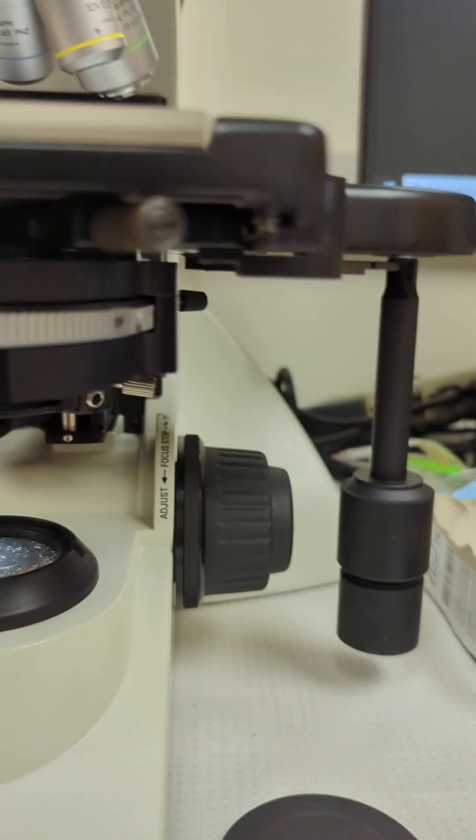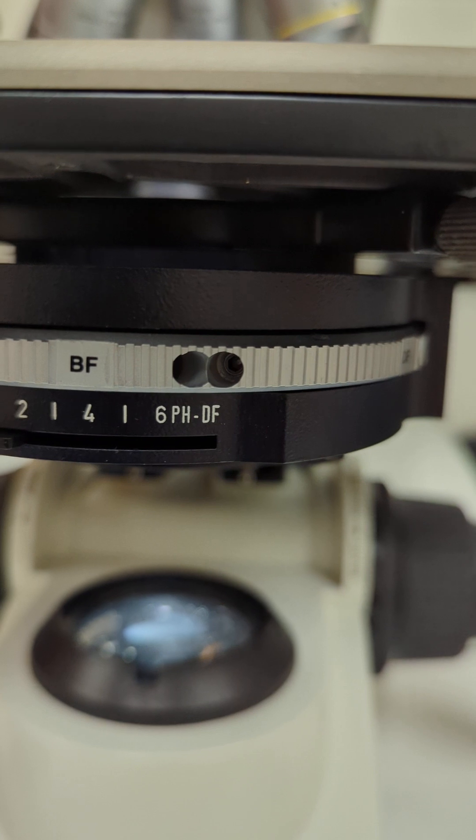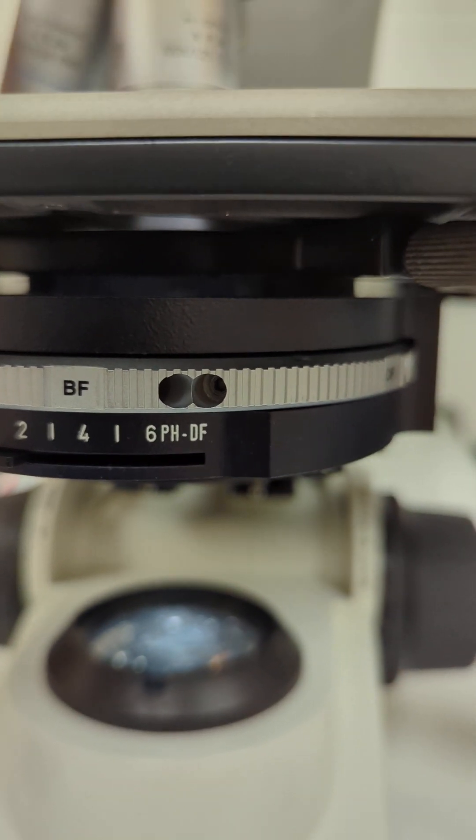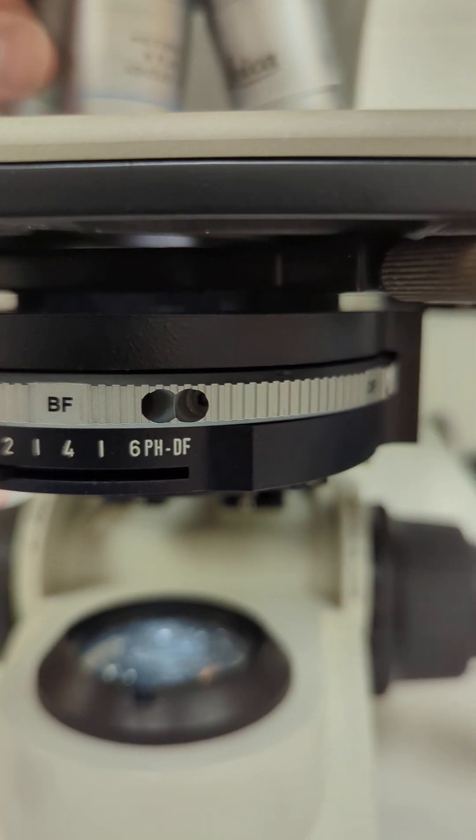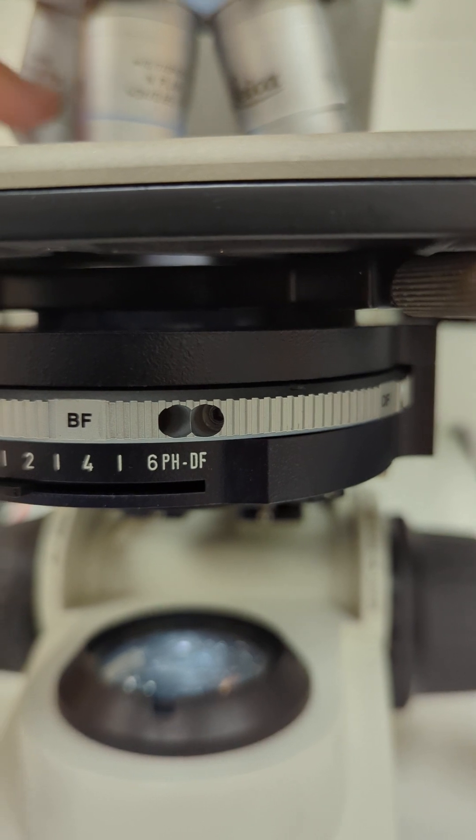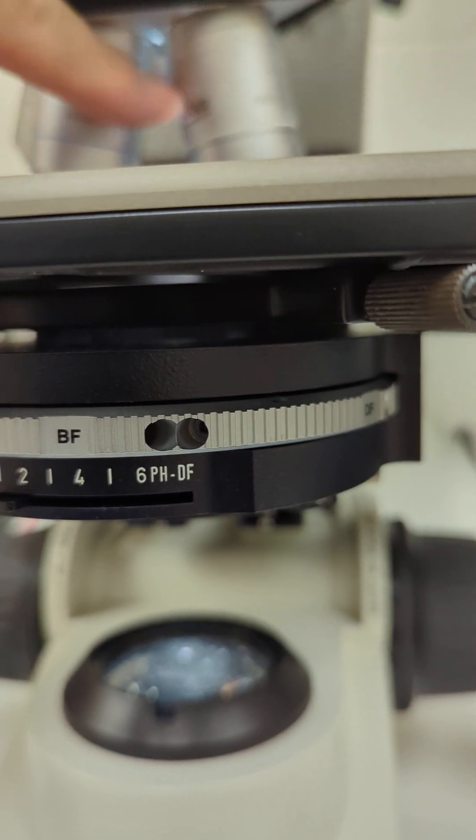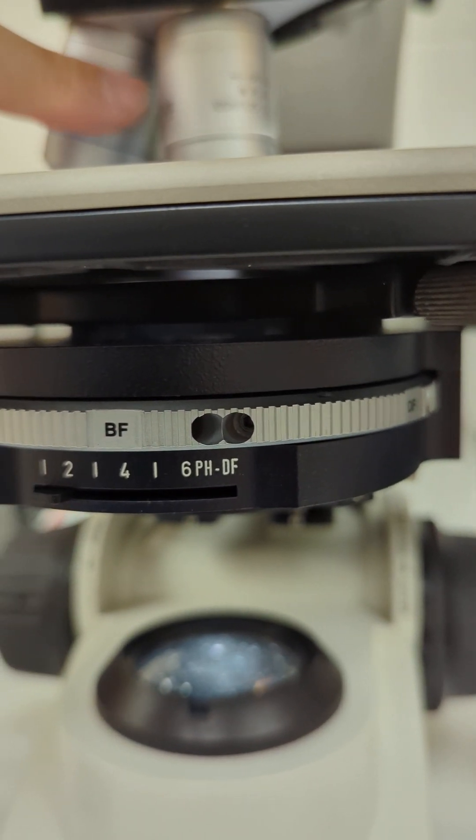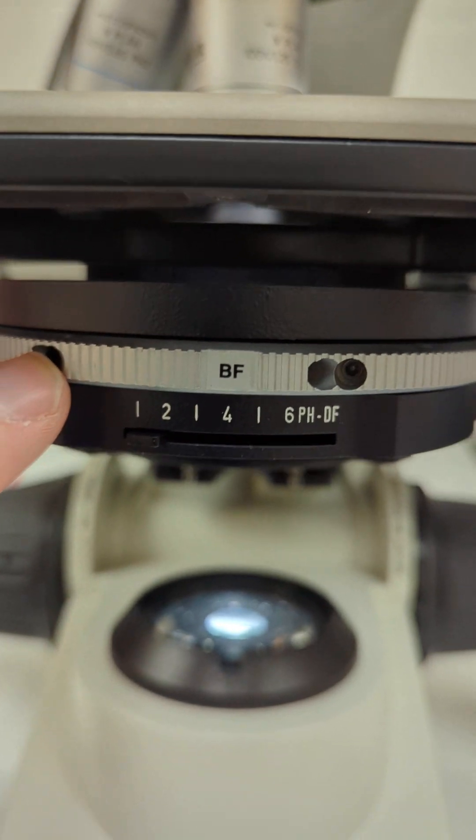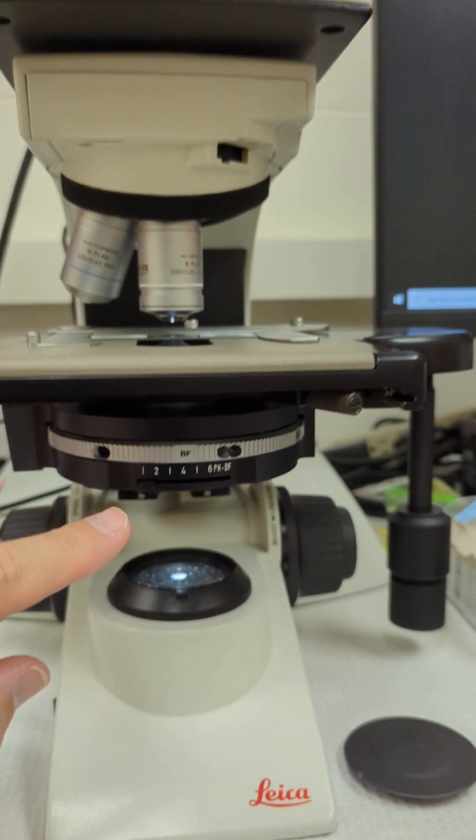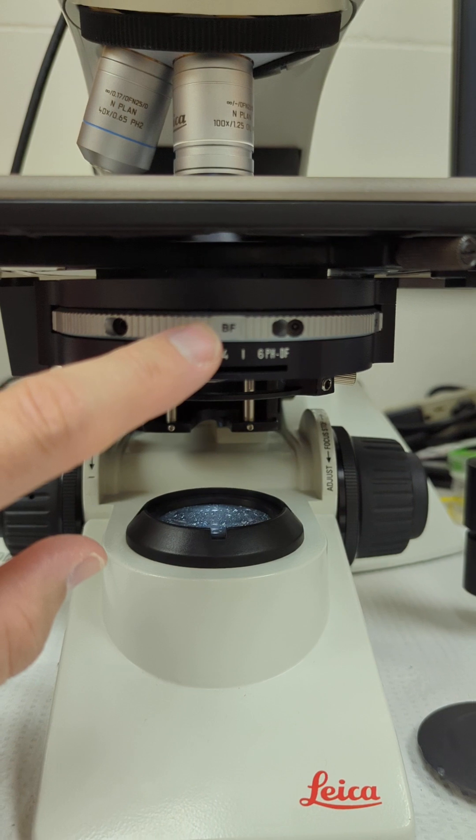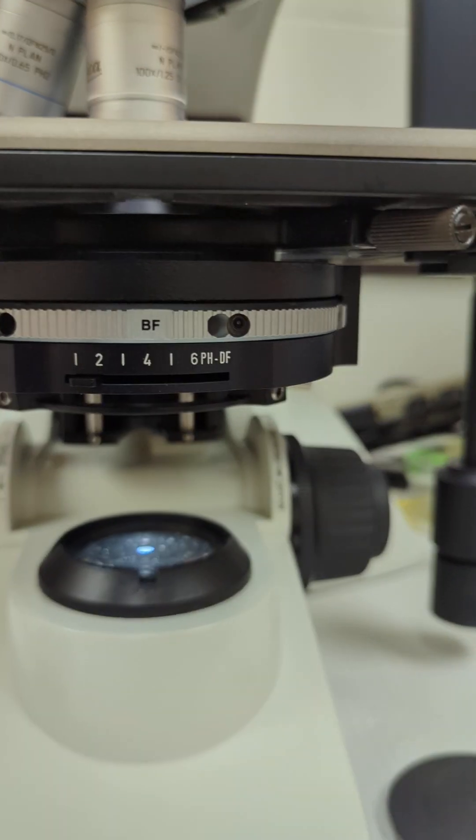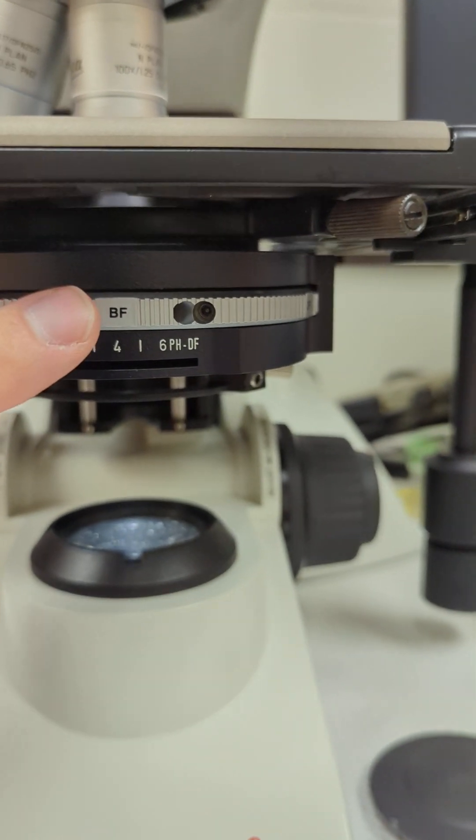We'll come back down here. These are phase contrast objectives, so you'll see a little Ph number: Ph1, Ph2, Ph3 on these. Those correlate to down here on this condenser under the stage.